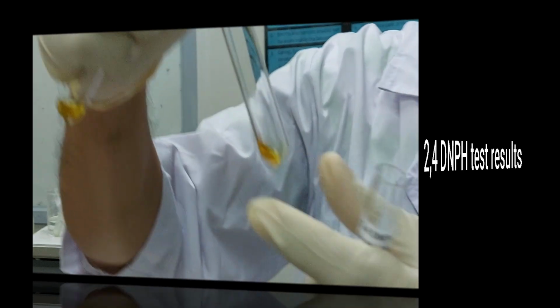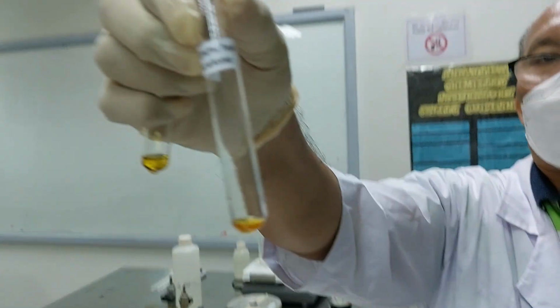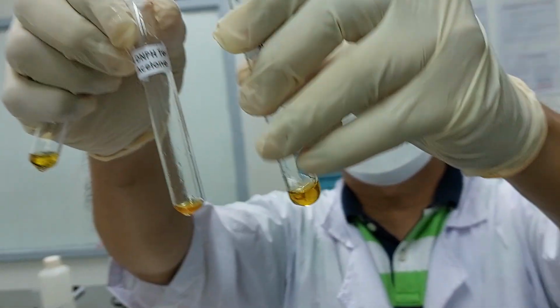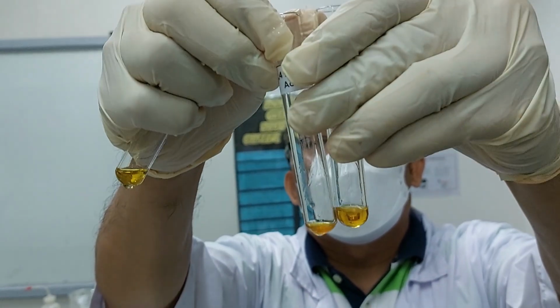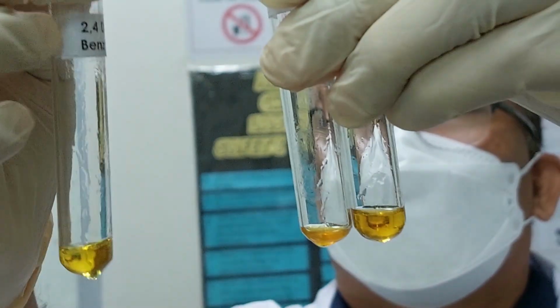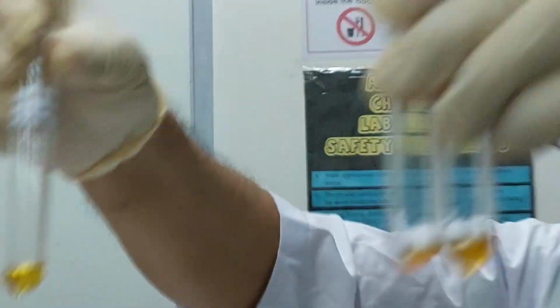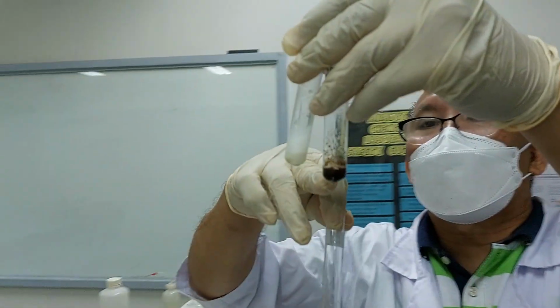So this is the result for acetone. You notice that orange color. So that's a positive test. This one is supposed to be positive, but we didn't observe that precipitate. Maybe it will take a longer time to react compared to acetone. The acetone is very fast, class. So you just let it stand. So this is the Tollens test, class.